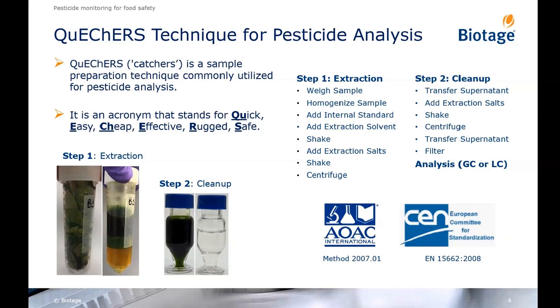And this is why it's become very popular in many food testing laboratories and is even recognized in AOAC methodology as well as the European Committee for Standardization. So it's used worldwide as a standard technique.